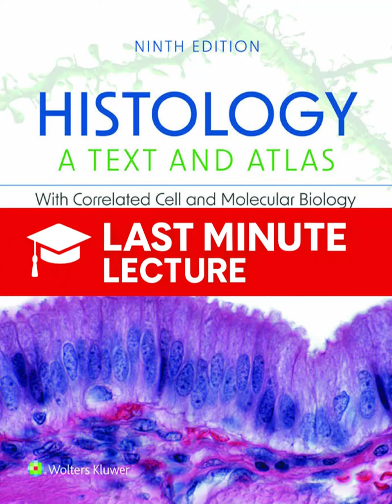It's resolving power, or resolution. And resolution is what, exactly? It's the smallest distance that 2 objects can be separated and still be seen as 2 distinct objects. The resolving power of the naked human eye is about 0.2 millimeters. And how much better is a standard bright field microscope? It's a 1,000-fold improvement. The theoretical limit of a bright field microscope is about 0.2 micrometers.